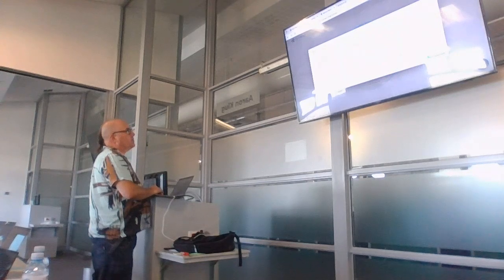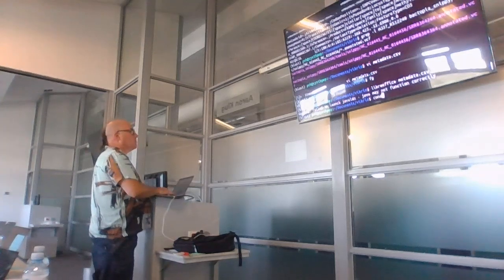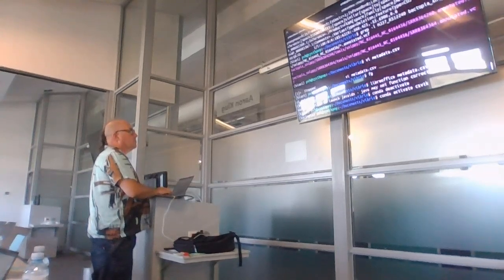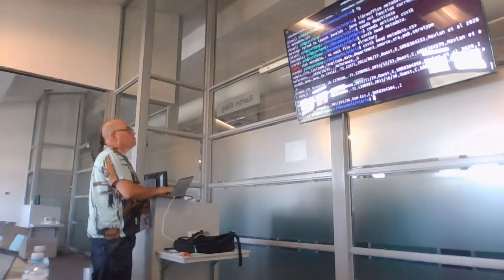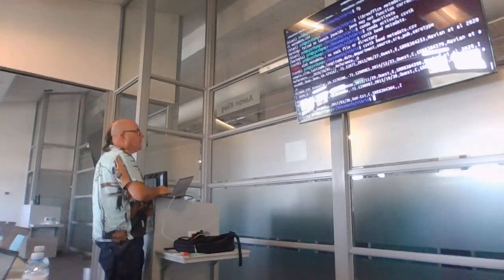I must have broken something. I'm not quite sure what I've broken, but I'm going to have to go back and look at that thing.